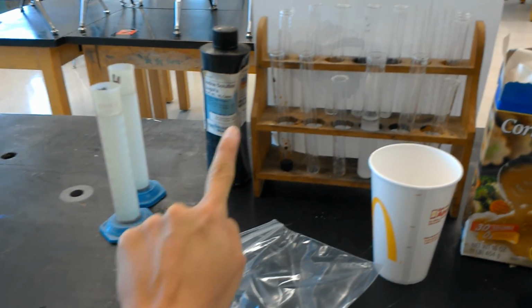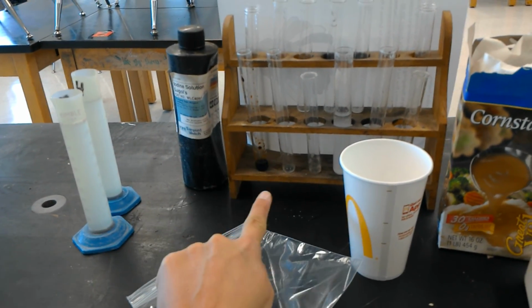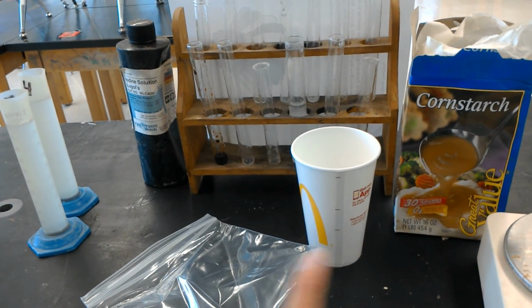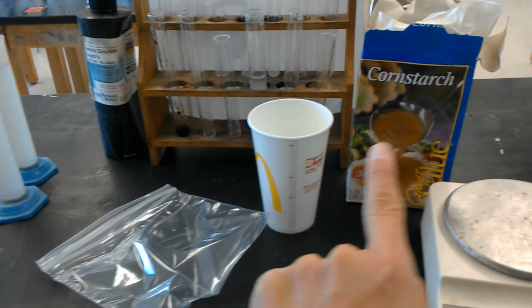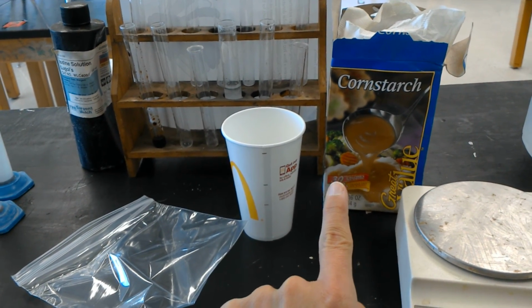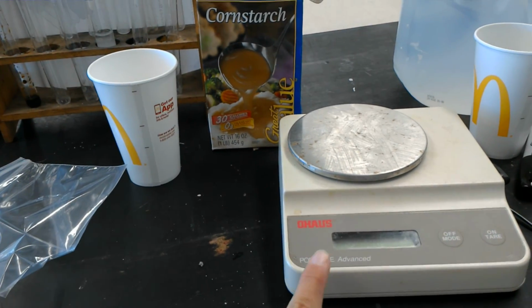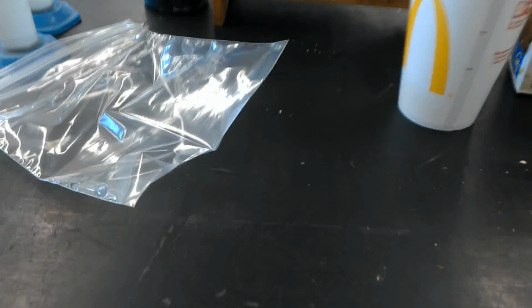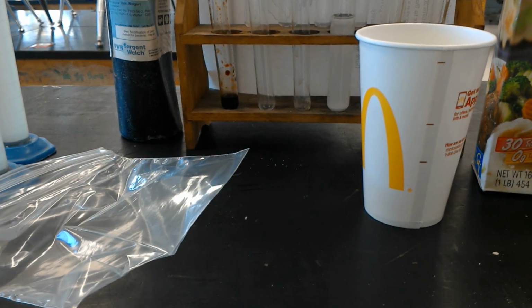For this lab, you will need some water, you will need some iodine solution, which will be already measured out for you in a test tube. You will need a cup, a plastic bag, and 8 grams of starch, which you will use the electronic balance to measure out. Before we get started with the lab, I wanted to show you some properties of these materials and how you'll be able to figure out what's going on.